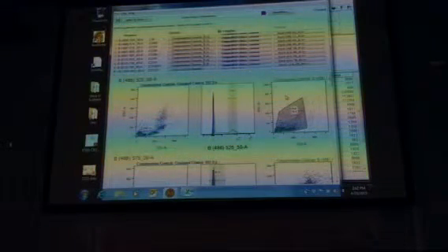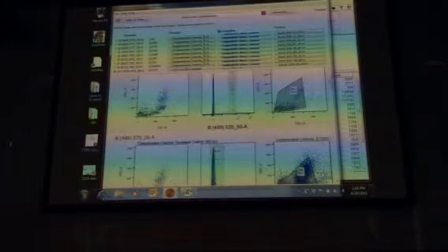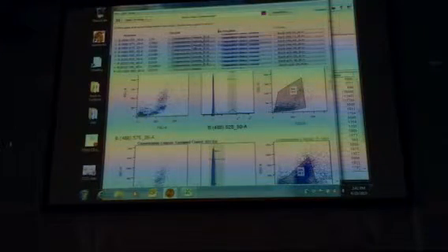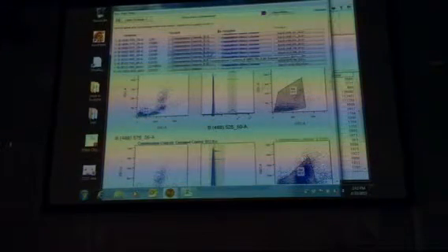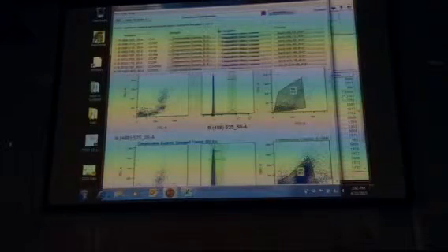You have multiple different parameters. So you go through that, that'll set this up, and then of course it'll calculate out the compensation matrix that you can then apply to your different samples. So, I'm going to pretend that we did that.